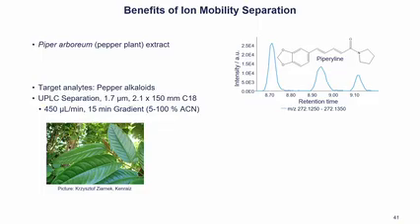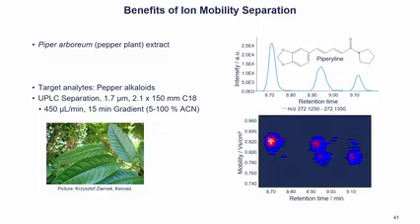And I think that makes perfect sense, because if you rotate one of those double bonds, you get very different shape of a molecule, so you get a different retention time. But if you rotate both bonds, then the molecule will actually look quite similar, so it's not going to be separated by the LC. But if we add the ion mobility dimension, we can actually see 4 different signals, so we can resolve all the 4 cis-trans isomers, and we can detect those in the data.